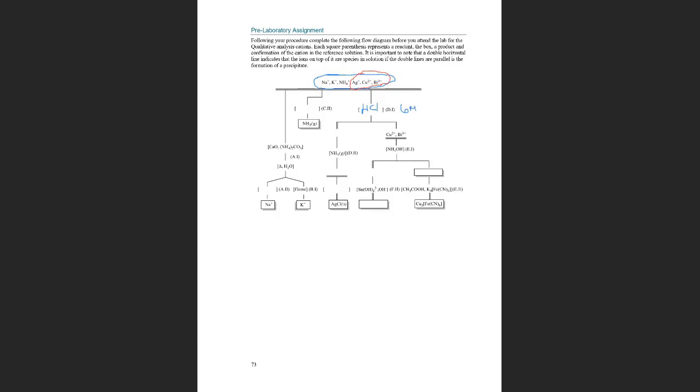And we just saw that hydrochloric acid with silver produces silver chloride. That is a white precipitate. So you are going to have the solid, and the other 2, the copper and the bismuth, are going to stay in the liquid.